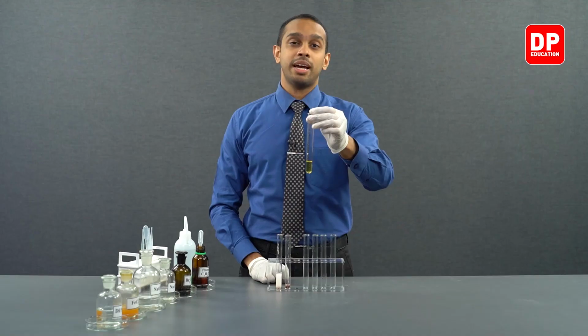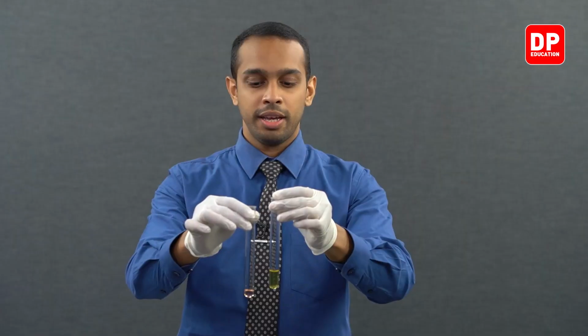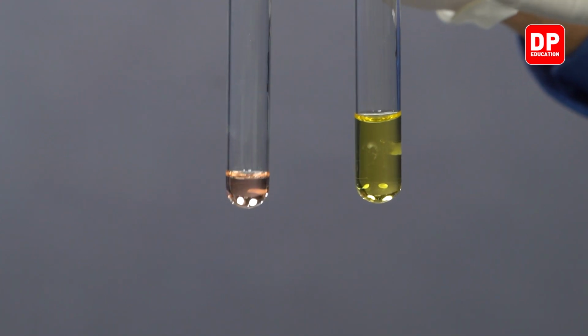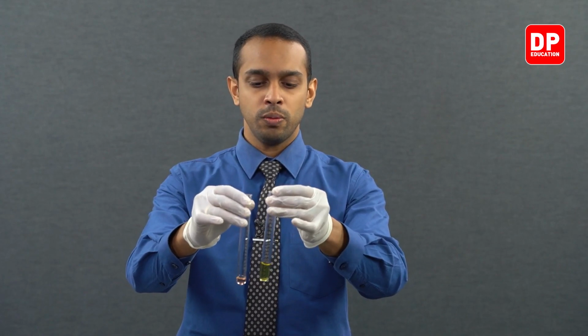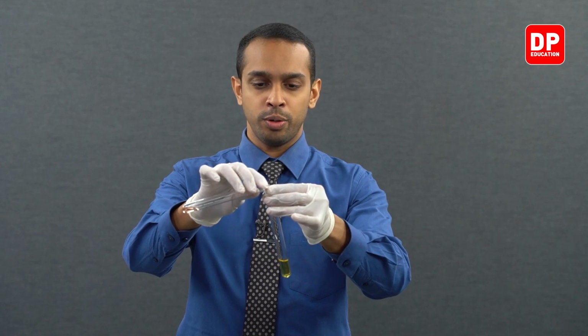The color of this bromine water is due to the presence of Br2 in this sample. Now, let's add a small amount of phenol into our bromine water. Observe the color of phenol. Due to the impurities present in this phenol sample, we can see it is pink or pinkish red in color. Now, let's add this phenol into our bromine water.